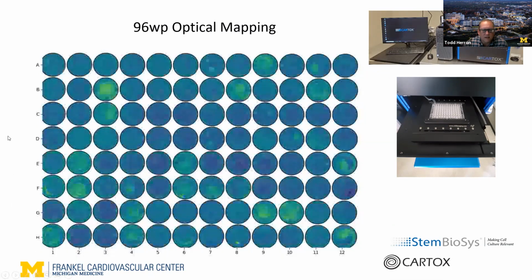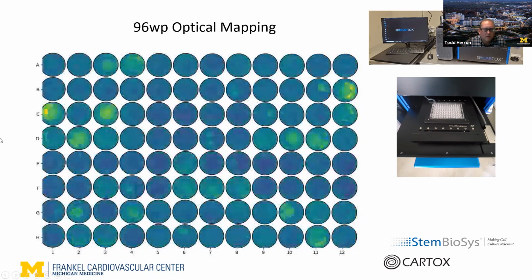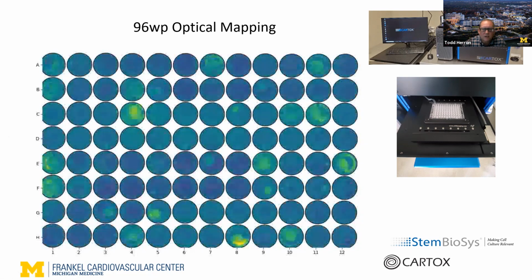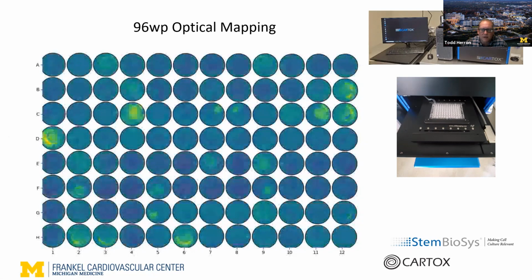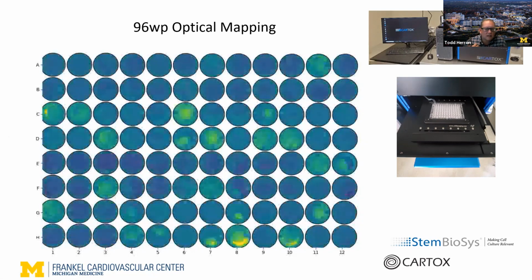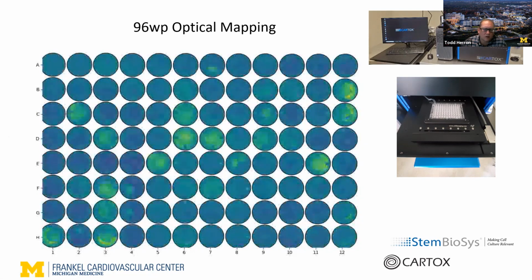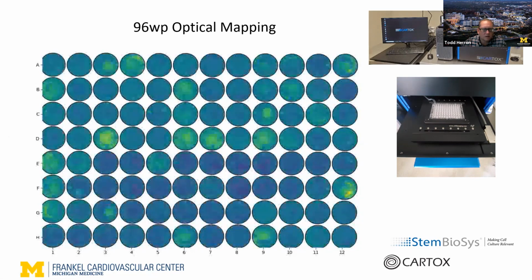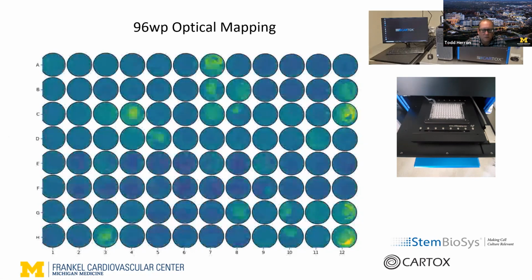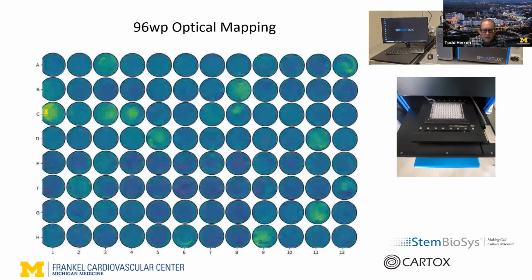So routinely in the lab now, we perform 96 well plate optical mapping. An example of that is shown here, where each well is loaded with a fluorescent dye to measure the action potential. And each monolayer has its own pacemaker, and we can record from all 96 wells and create very robust data sets with very high numbers and very good resolution.